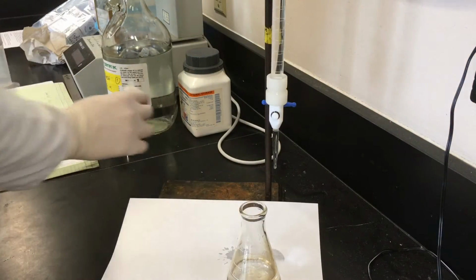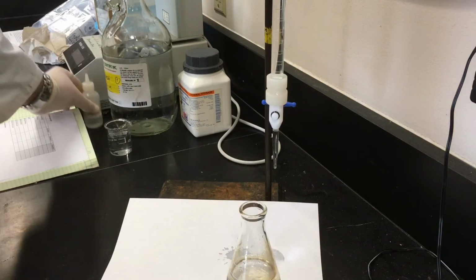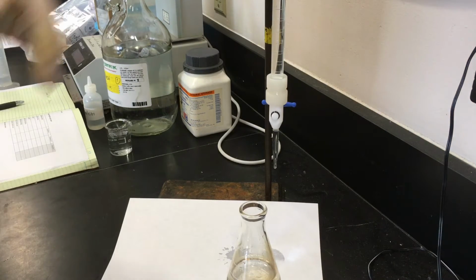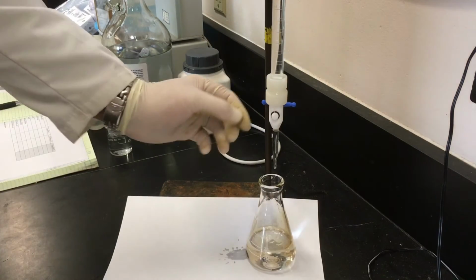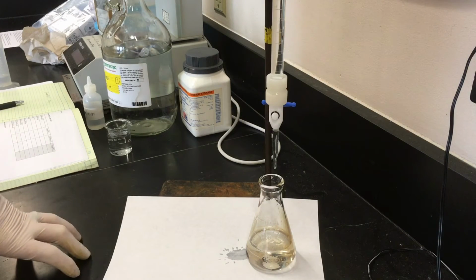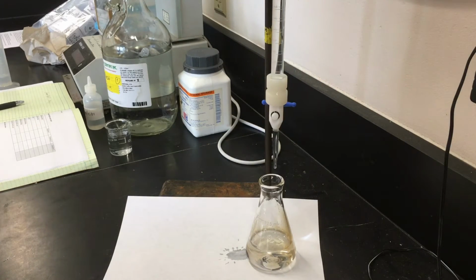We're going to put in a few drops of phenolphthalein indicator, and phenolphthalein will change color between 8 and 10. And since we're titrating a weak acid with a strong base, our equivalence point will be basic. So phenolphthalein is a good choice of indicator for that. Our burette is loaded with the NaOH, and so we're going to titrate to the end point. Hopefully we'll get it to 1 drop of a color change.